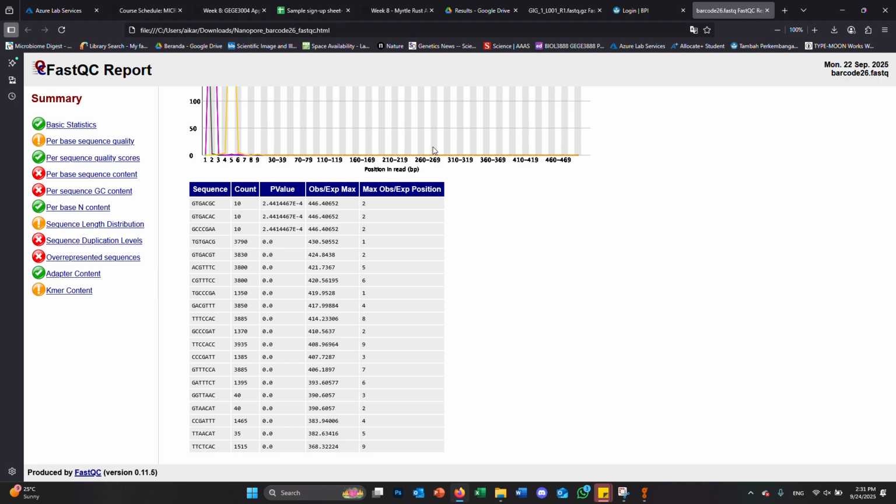So, take home message. Phred scores. Basically, the words I have on this slide here: the Phred scores are much more variable and the read lengths are much longer in Nanopore data. Whereas with short read data, Phred scores are consistently high, and read length is very consistent and the same.